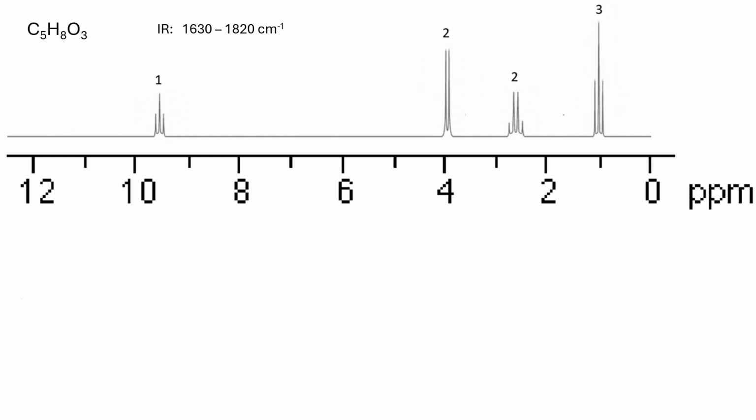First thing I'm going to notice here is the molecular formula. It's important to keep that in mind as you're starting to think about the structure, because obviously what you come up with has got to fit that. So notice how many carbons, how many hydrogens, but notice those other elements as well. Even though they won't show up directly in NMR spectra, they obviously affect the chemical shifts, and so you need to be thinking about them as you're interpreting the shifts in what you see.